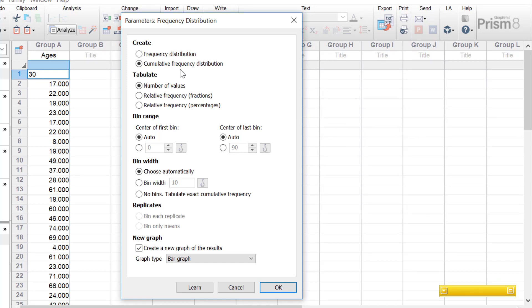As well as graphs, GraphPad will also return data in table form. There are three options: the first is the number of values, which returns the count of data points in each bin. The next option, relative frequency in fractions, returns the fraction of values in each bin rather than the actual count. Similarly, relative frequencies in percentages returns the percentage of values in each bin rather than the actual number.